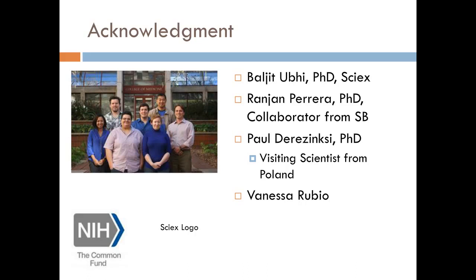Okay, with that, I hope that I've given you an impression and an idea of where metabolomics can go in the future and what it can do for prostate cancer diagnostics. I've shown you the ability of untargeted workflows to decipher the spectrum of health and the spectrum within the prostate cancer diagnostic potential for the future. And we hope that under our current guidelines and our current research, we'll be able to expand in the near future to a larger scale study to confirm that this is true.